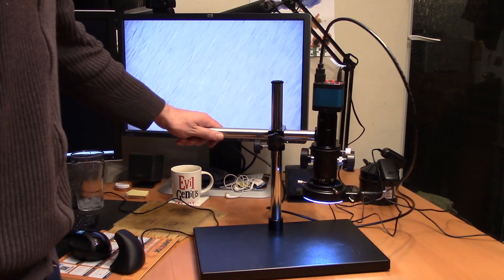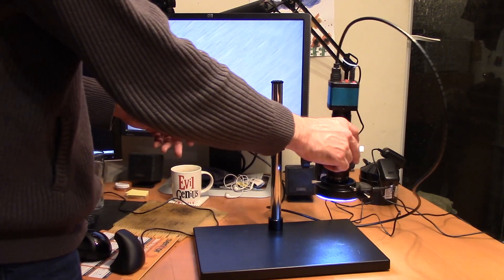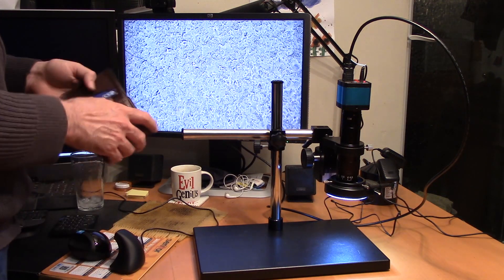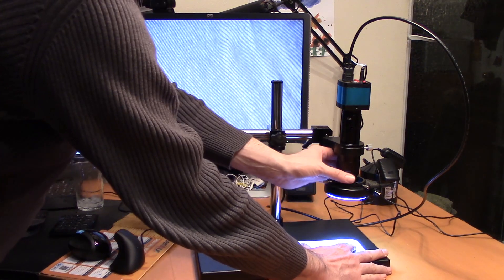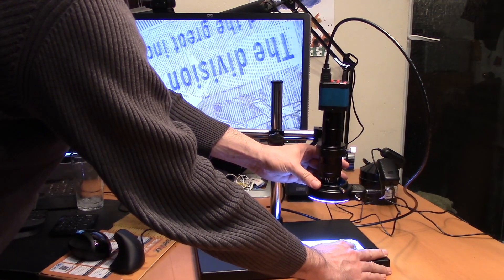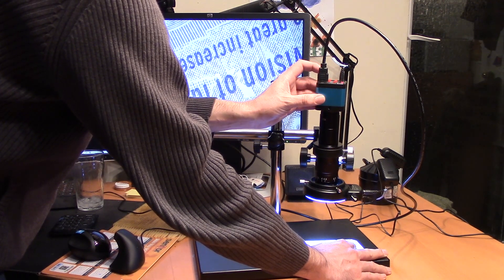I really like this stand. It's actually been a couple of days since I recorded the unboxing, and I had the chance to play around with it. When you set it up right, it's absolutely lovely — it lets you do silky smooth panning across images. So we've got a British £20 note there. Get it nicely in focus. You can just so smoothly move across this. I should hit record — there we go, we're recording now.